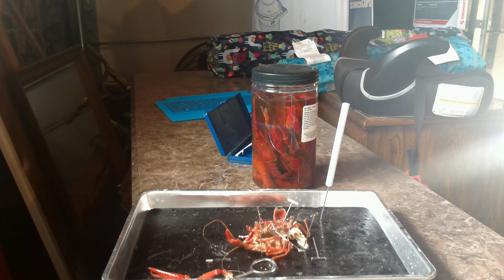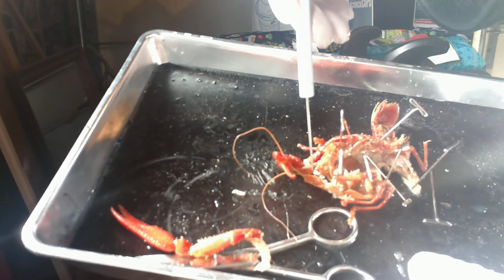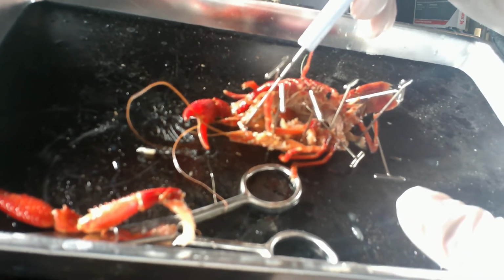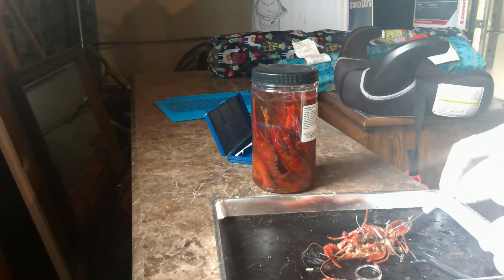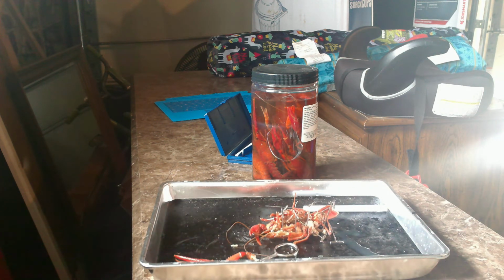And besides that, I didn't get to show it to you guys because I had to crack it open a little bit to get you a better view of the organs. But up here at the head, we have a slightly larger nerve ganglion. I don't know if you guys will be able to see it or not, but it's right here and it's quite a bit larger than what we saw on our freshwater mollusk example. Roughly 2 to 3 times the size of the nerve ganglions that we were looking at with the mollusk. So more complex nervous system, more of a linear digestive system, a centrally located reproductive system.